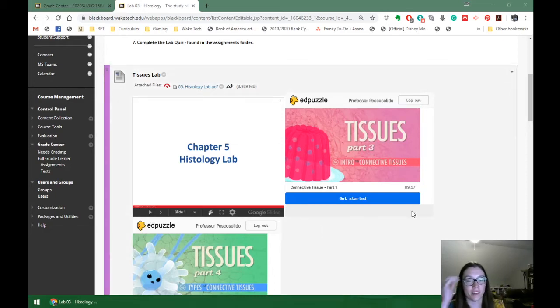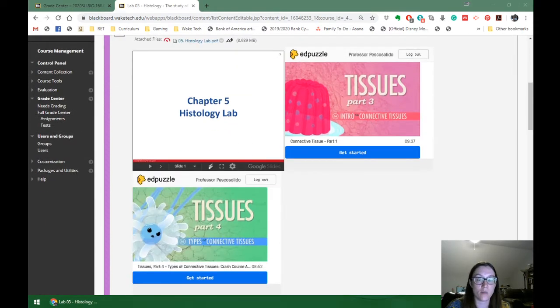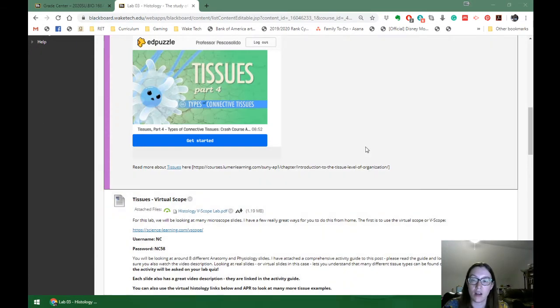All right, I want to talk about your tissues lab today. So before I go over our long PowerPoint, I want to mention that there's a couple other things that we're going to be looking at today. Since this is mostly all microscope slides, I've got a couple ways for you to look at them online.